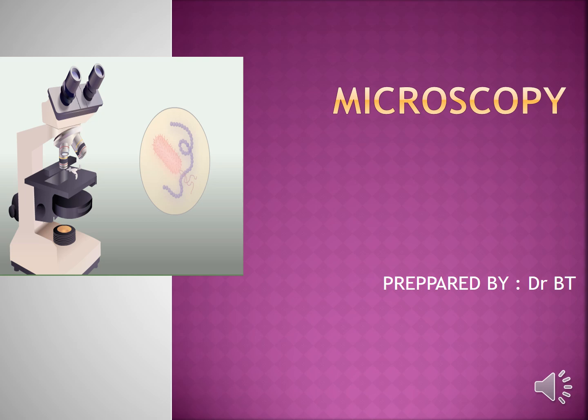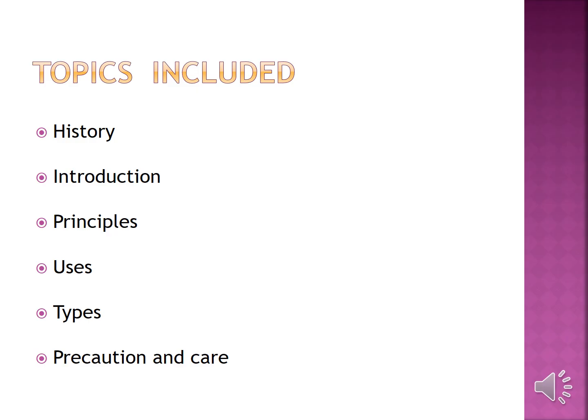Microscopy. This is the updated version of the previous videos which I posted. Many of the students were unable to understand microscopy, so I made a repeat video. Okay, shall we start? Here we'll talk about the history, introduction, principles, uses, types and precautions.